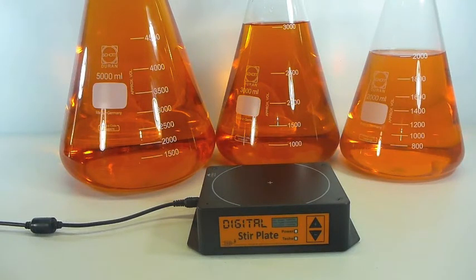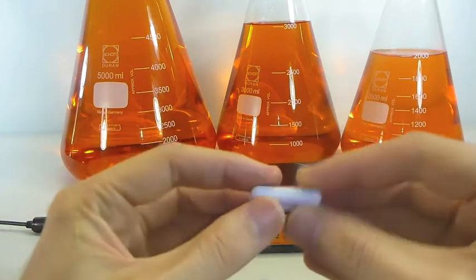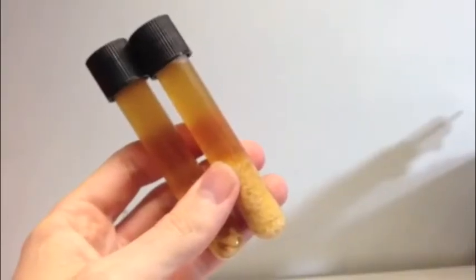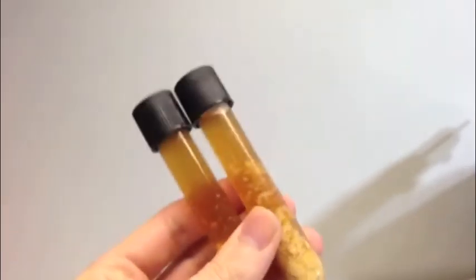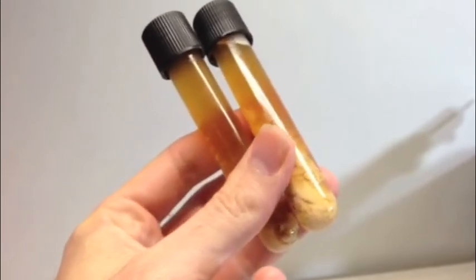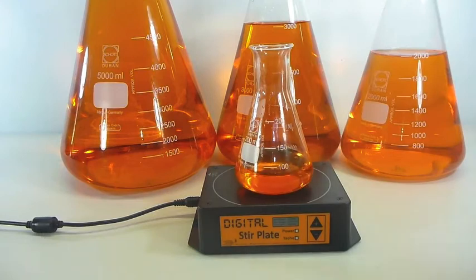Hopefully this will result in a more consistent pitching rate, and of course that helps you brew more consistent beer, and then you can focus your time on the obvious variables like your recipe. With the provided 30mm stir bars, the digital stir plate is a very versatile unit. Many brewers like to build their starters up from single cell cultures and make lots of small steps, or maybe even divvy up your smack packs to save on money, making a small starter and then a larger final starter later on. While efficiency isn't such a concern for your smaller starters, I just wanted to demonstrate that the digital stir plate is quite capable of stirring even small starters under 100 mils.